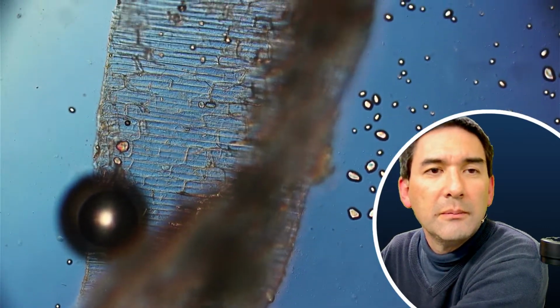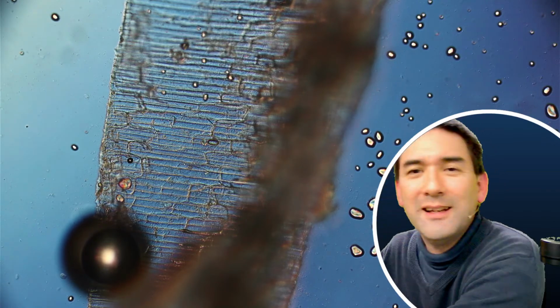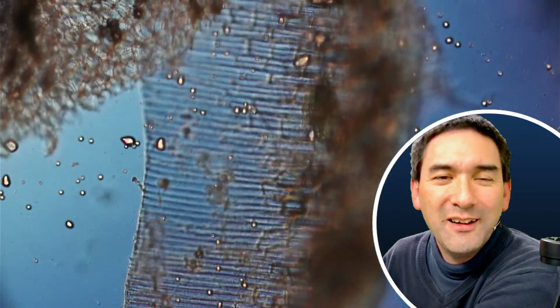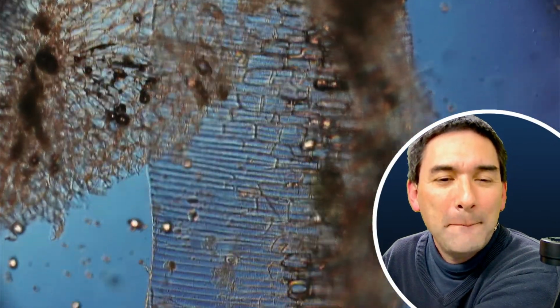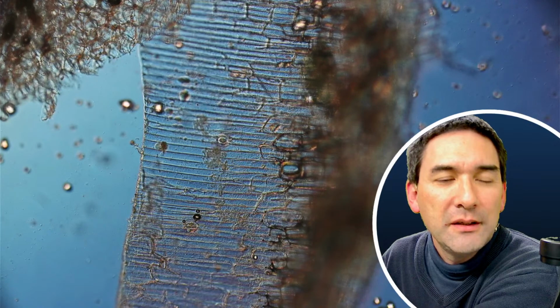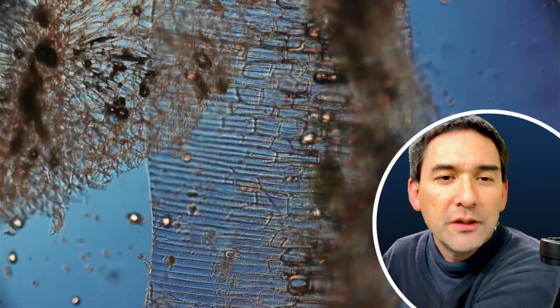Okay. Yeah. But at least what we can see here is, there are still some starch grains, maybe from the knife. Okay. But I'm quite happy to be able to see that the cross section is fairly thin, that I'm able to see individual layers of cells. So let's zoom in a little bit more, turn up the light. And it's gone. How is that? Okay. Here we go again.